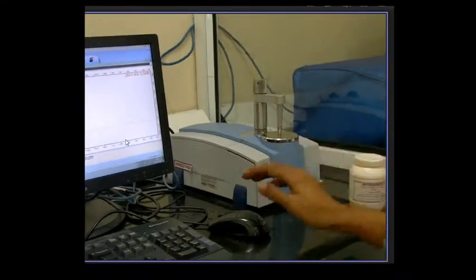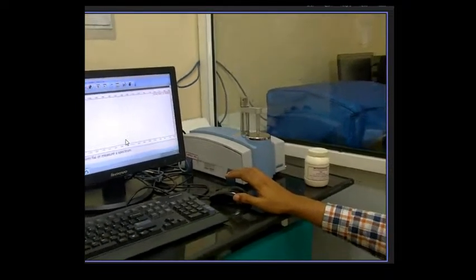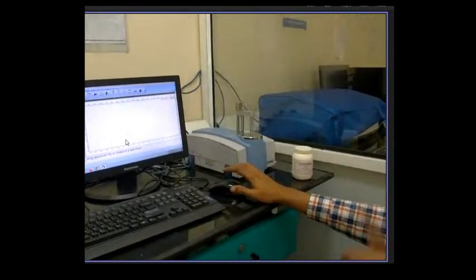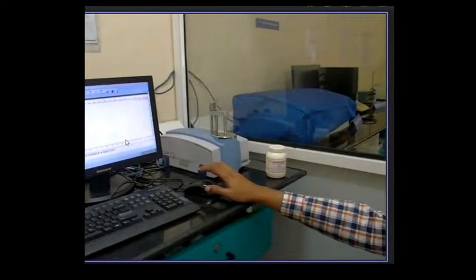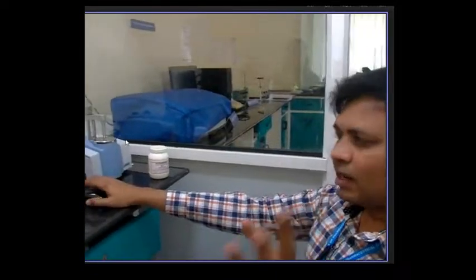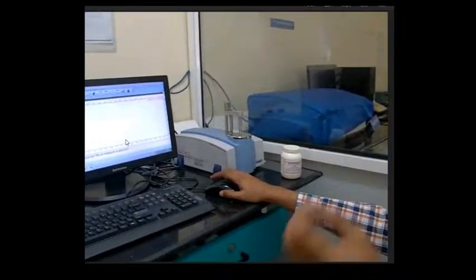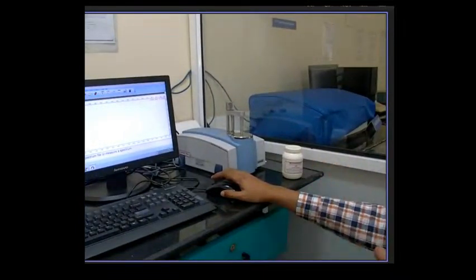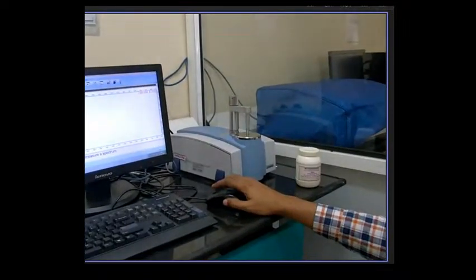Okay. So the problem with that pressure pellet, the first thing is it is a consumable. Every time you need to use the KBr, and KBr is costly in that case. For each sample, the cost is around 40 to 50 rupees for the KBr only. Once the experiment is completed, that pellet we have to throw in the dustbin, so the KBr also we are losing along with the sample. And also time. You need to mix it and then press it, keeping it in the window. It is a time-taking process, so that's why there is another alternative technique, the ATR technique.